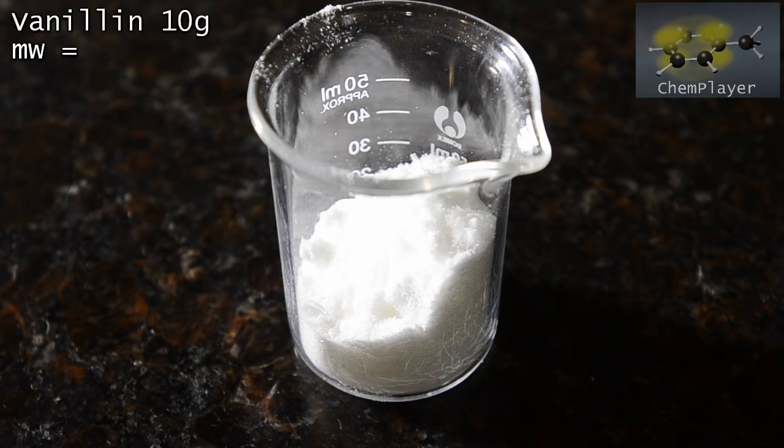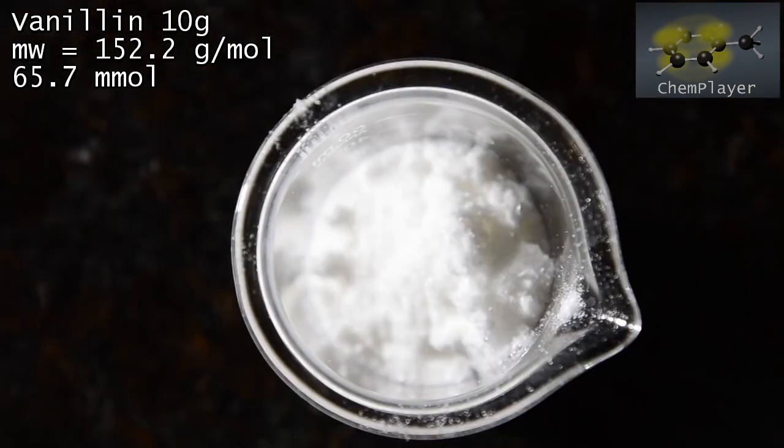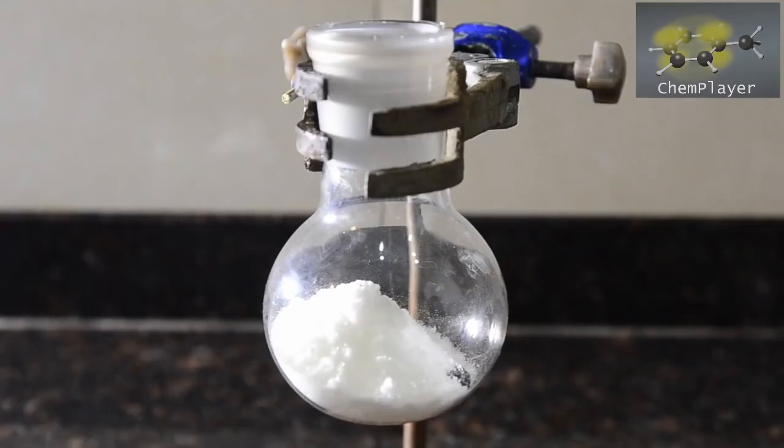We weighed out 10 grams of our 99% food-grade synthetic vanillin. We know from experience that it's not completely dry, but we don't think this will affect the reaction. We transferred this into a 100 ml flask equipped with a magnetic stir bar.